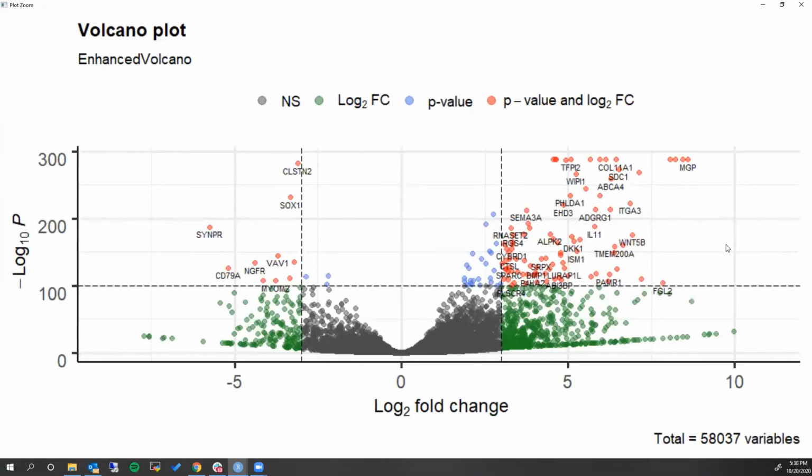All right, so now we've got our volcano plot, and one of the things you might notice is that because we did our log fold change shrink, it's a lot nicer than it would be otherwise. If you plotted it without doing that, you would find the values are way to each side and don't make a whole lot of sense. So it's much easier to interpret the data visually now, which is why we do that. We can see the genes that have the greatest fold change and the greatest significance for differential expression, and then the least fold change, so the most underexpressed. So basically top overexpressed, top underexpressed genes.